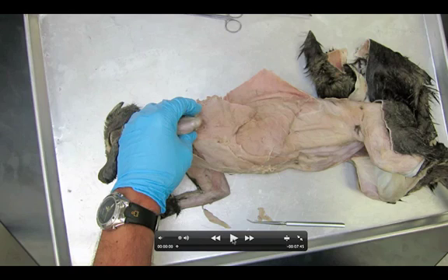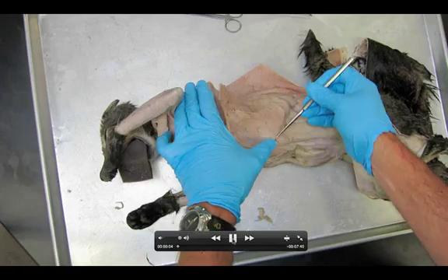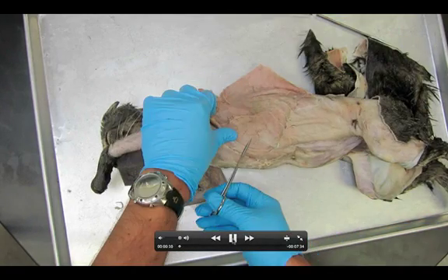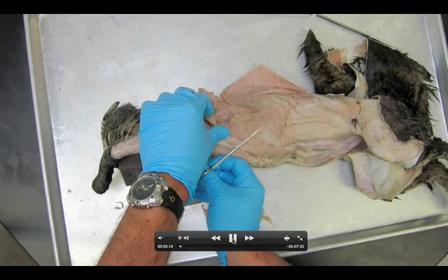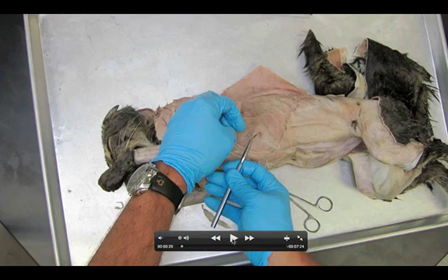Welcome anatomy students. This is our video for dissection number five of the abdominal muscles. First thing we're going to start with on this dissection is we need to locate the ribs. We're going to use our scissors, and we're going to start our first incision on the external obliques over the ribs. It is super important that we all start in the same place.